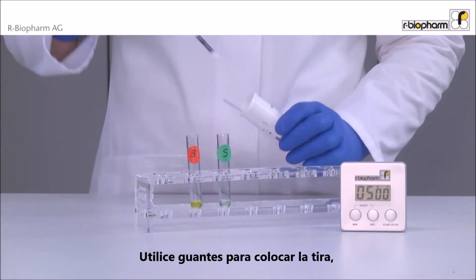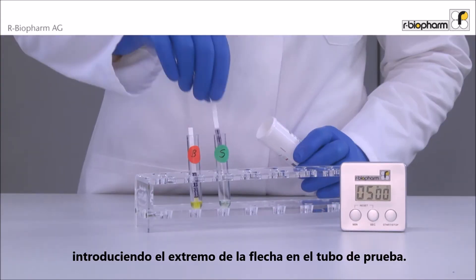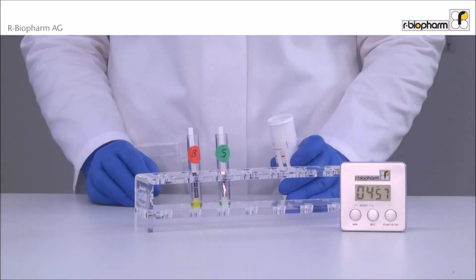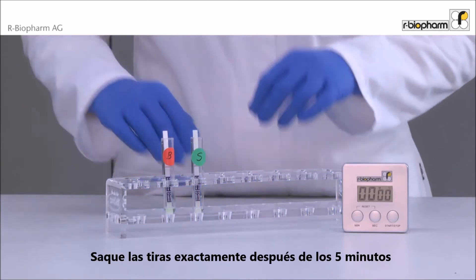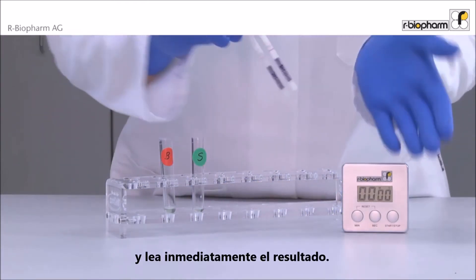Use gloves while placing the dipstick vertically with the arrow end into the test tube. Incubate the strips for five minutes. Take out the strips exactly after five minutes and read the result immediately.